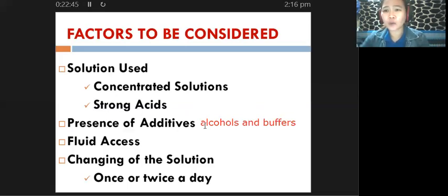What do you want to achieve? Do you want the decalcification process to be fast because you need to provide an immediate diagnosis? Or do you want to protect your tissue samples regardless of how long the decalcification process takes? All of these factors you have to consider. Your additives will protect your tissues, but they will slow down the process of decalcification.